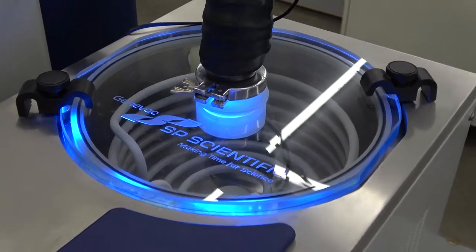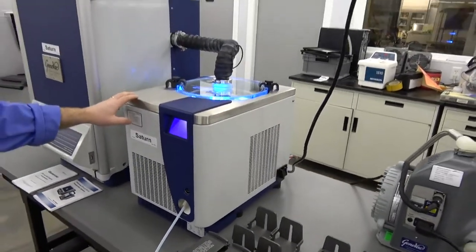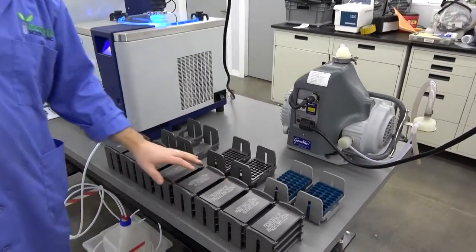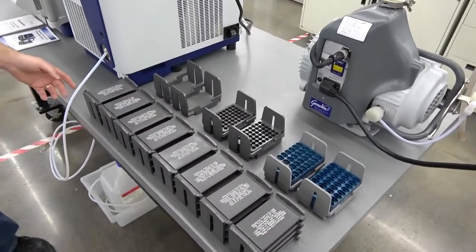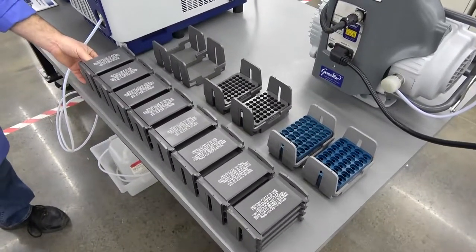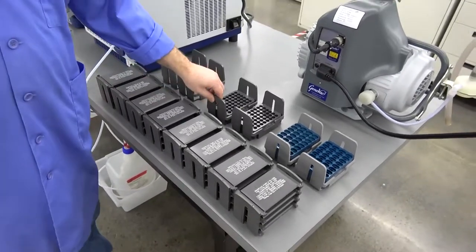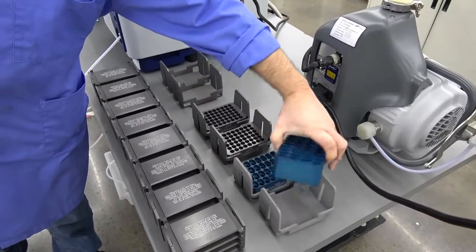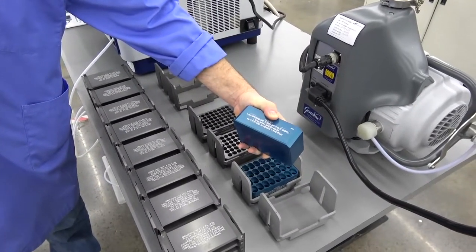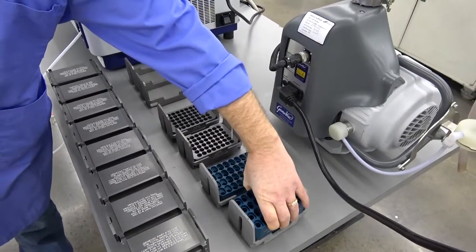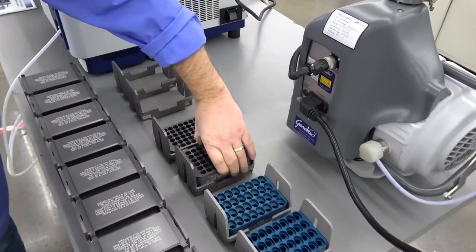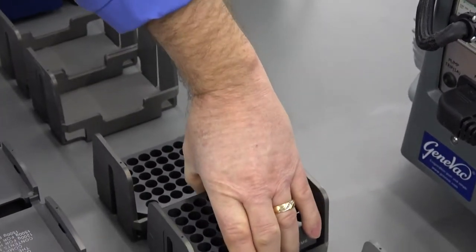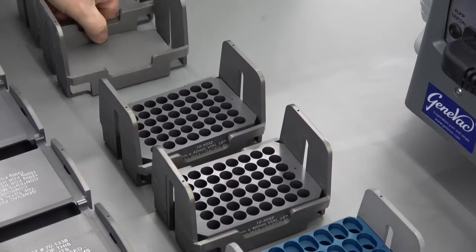And then also what you're getting, you're getting a lot of accessories too with the swing buckets here. You're getting eight microplate holders here and each one holds three microplates. You're getting four swing buckets here and you've got two blocks for vials here. That's the Eppendorf tubes block. You've got two of them.